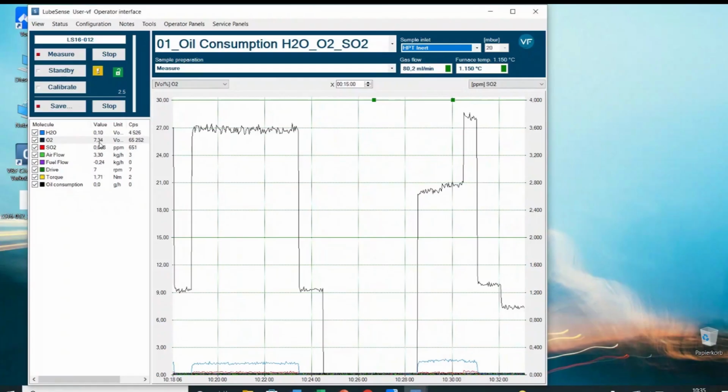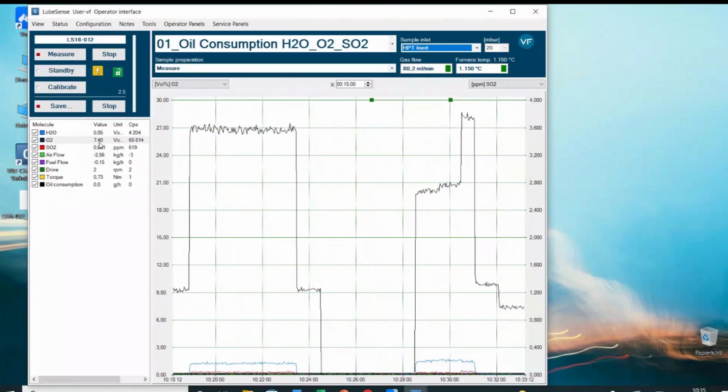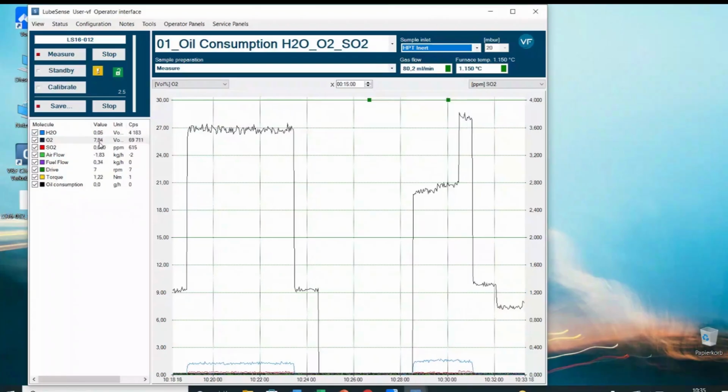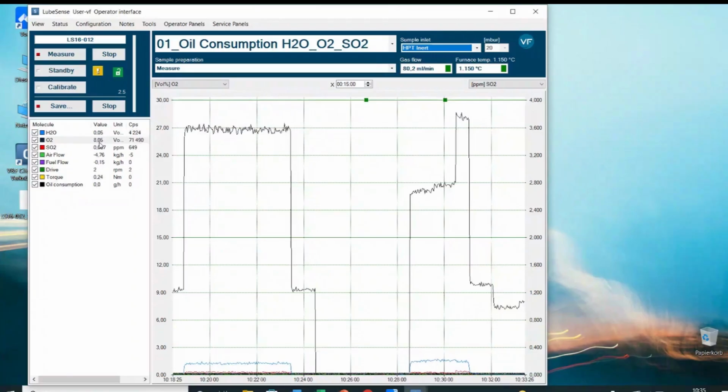Meaning what you will have to do is keep the system in this state, and then set up the flow on the needle valve. So I'm going to try to close the needle valve. This is a clockwise direction movement. And after doing this, I will check again where our oxygen level lies. As far as I see right now, we are still at 8 volume%.